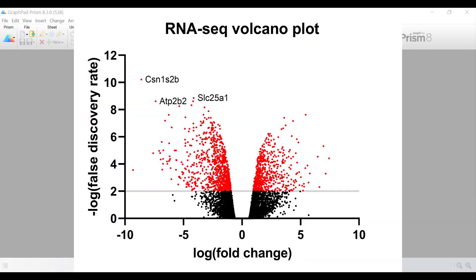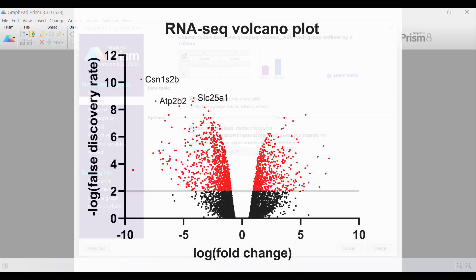Hello, my name is Dr. Stephen Bradburn from TopTipBio.com, and in this video tutorial I will show you how to create a volcano plot in Prism.